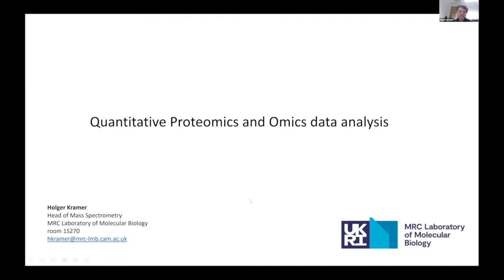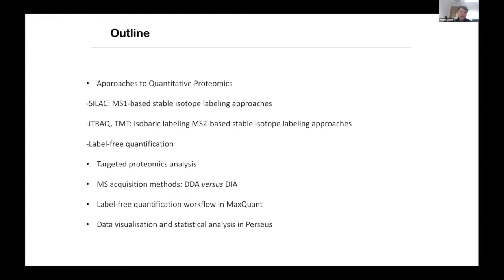This is really an introductory lecture to methods used for quantitative proteomics data analysis, and then a closer look at how this data can be processed and visualized towards the end of the lecture. And just to give you an outline of what I'll try to cover here, I'll compare a few different approaches to quantitative proteomics.